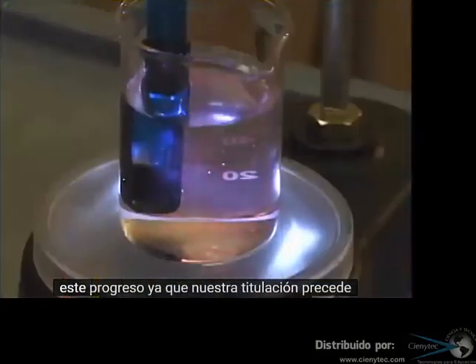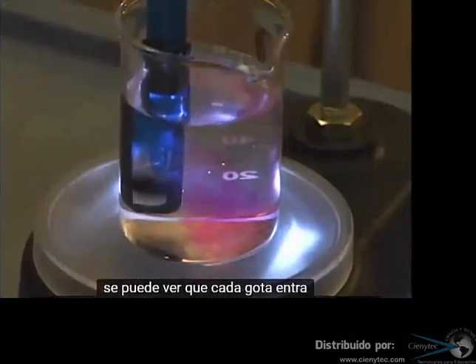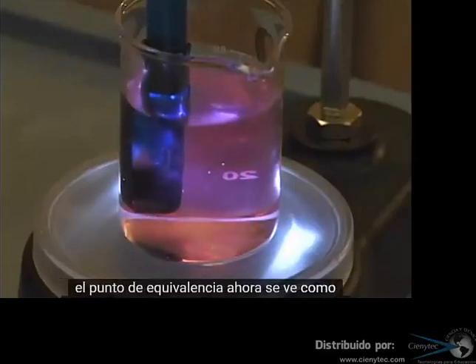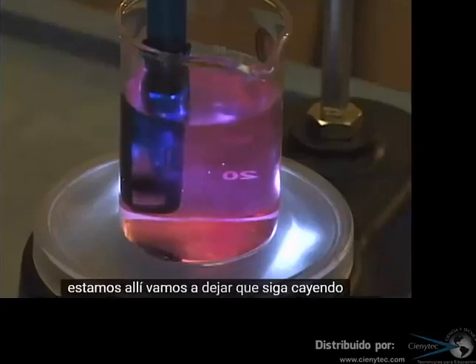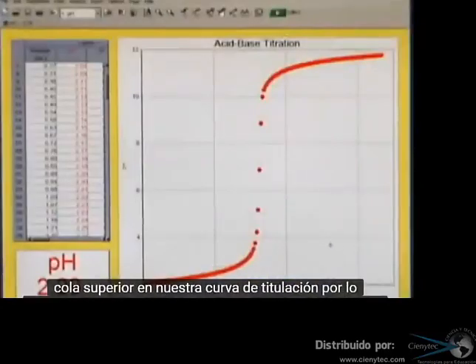I put some phenolphthalein in here, and you can see as each drop goes in, we're getting some pink. It's lingering longer with each drop, so we're really close to the equivalence point now. And it looks like we are there. We'll let it keep dropping a little while longer so we can get an upper tail on our titration curve. So here's our completed titration data.